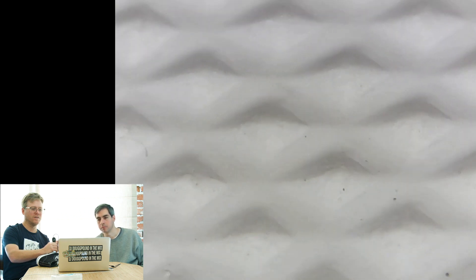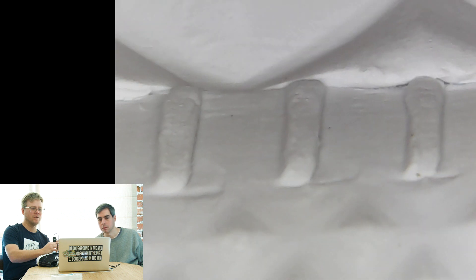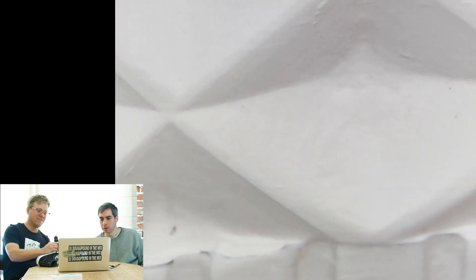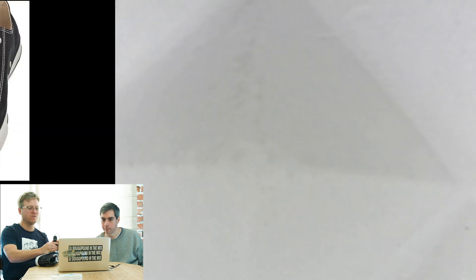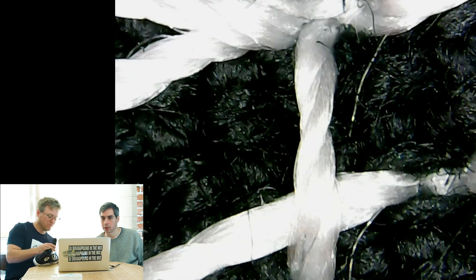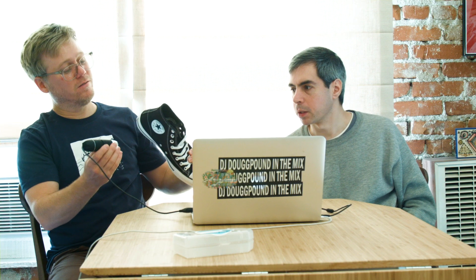Here's what we got with this pattern on the side. You've got the bottom rubber sole, and then you've got the edge. You go up here and you get these — kind of like little diamonds. Blue diamonds. And then you have these bigger diamonds here — that looks kind of cool. If you're not looking at the shoe, you probably have no idea what this is. It's the rubber outsole that goes up right before it hits the canvas fabric. And then here's the white stitching on the black — they call that contrast stitching. And there's a Converse logo here on the heel.